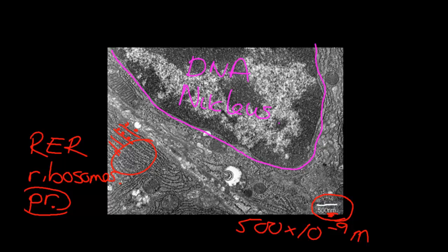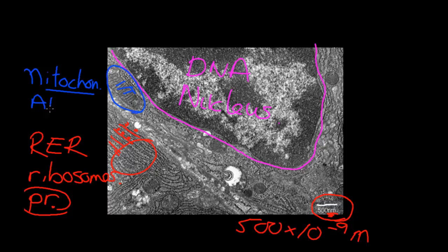There are a couple of other features to notice in this section. Up here, can you see this structure sitting here — with the edges and the lines running into it? This is called a mitochondria. Mitochondria produce ATP, which is really the mechanism by which energy is transported around the cell. So this is what a common transmission electron micrograph looks like.